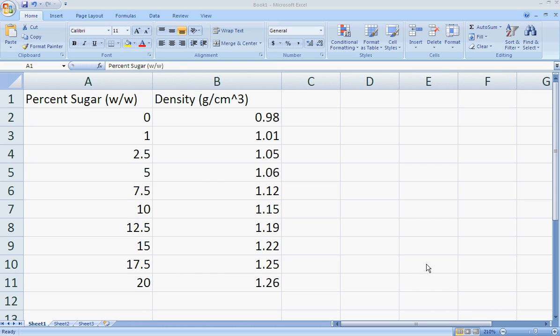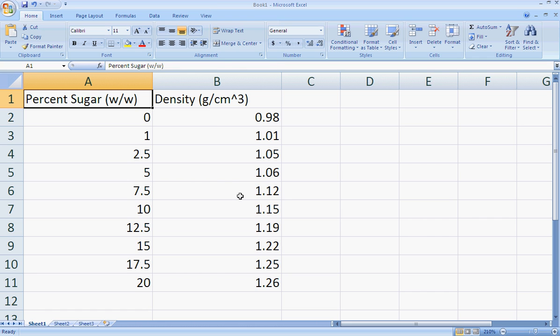This video is for my students to show them how to use Microsoft Excel 2007 to create a nice calibration curve, specifically an XY scatter plot.